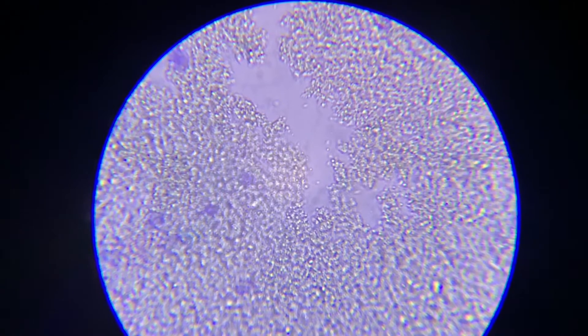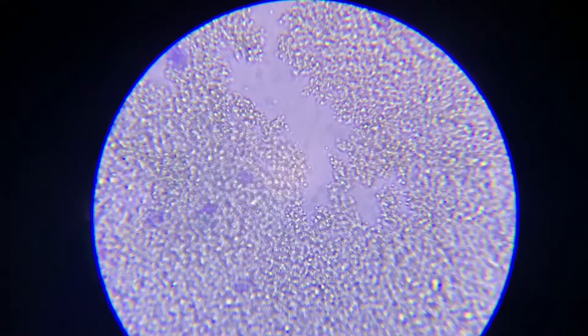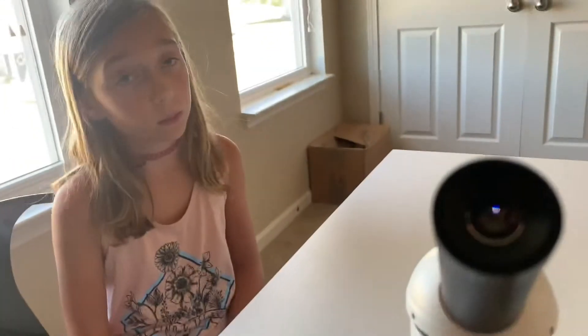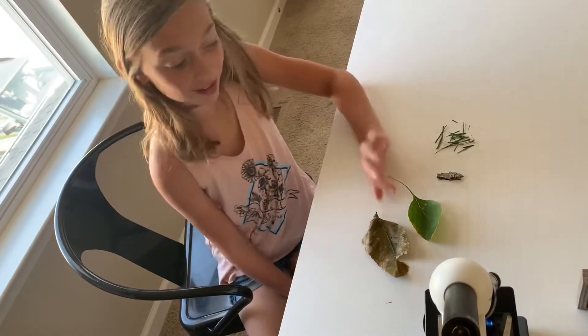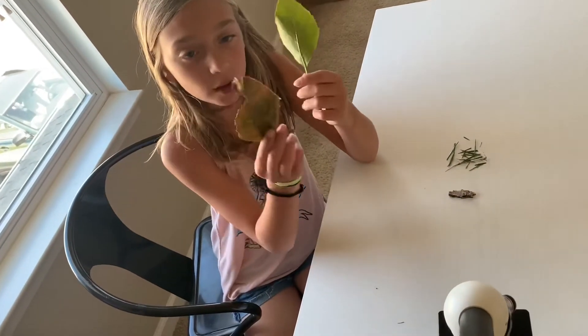That's crazy! Yes it is. How many do you think are right here in this picture? About a thousand? A trillion! Yep. I have grass bark, which is going to be awesome, I have a green leaf, and then a diarrhea leaf.